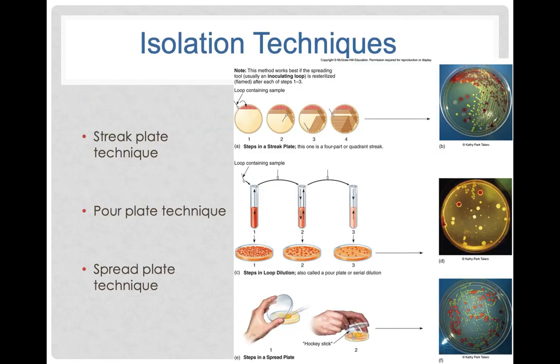There's quite a few ways to do this. The most common one is something called a streak plate, or streak for isolation technique, where you use a very specialized process of streaking bacteria around on a plate in a certain angle, a certain way. There's lots of different ways to do this. And what you do is, you can see over here, you've got a bunch of bacteria all condensed together. You could not get in there and figure out what colors, what species there were if you needed to. Spread them out this way, and they're starting to get a little spread out. You can start to see some red in there. You can start to see some yellow.